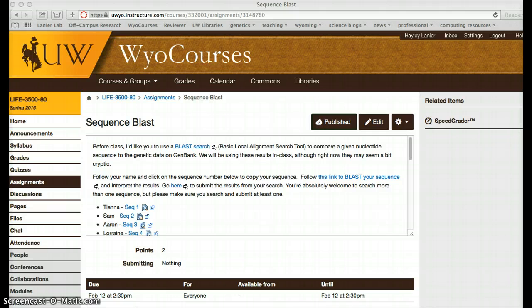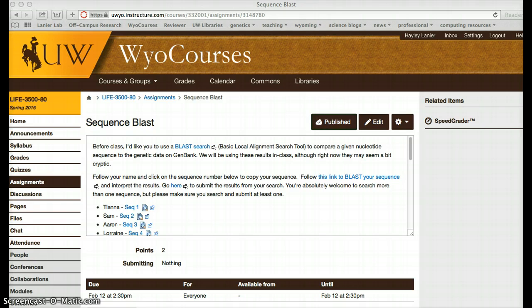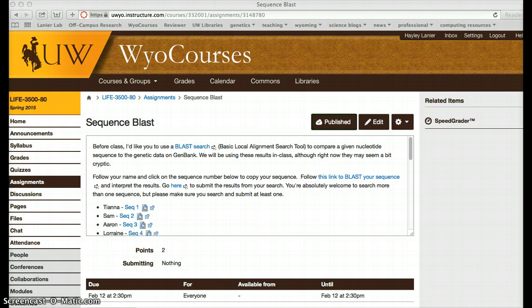In this case, we're going to be using the database that the National Centers for Biotechnology Information has, so it's GenBank, and that is a place where all researchers who publish scientific papers have to deposit their data. So basically, this is one of the most comprehensive databases of nucleotide data and sequence data there is.